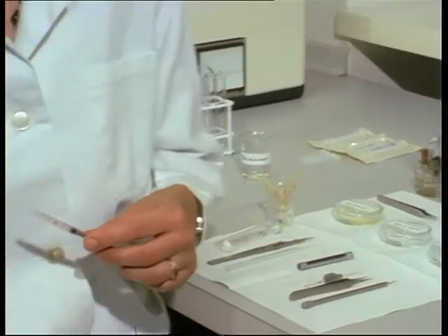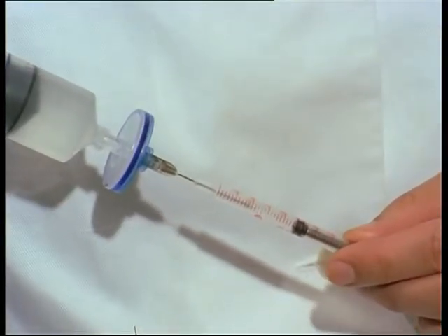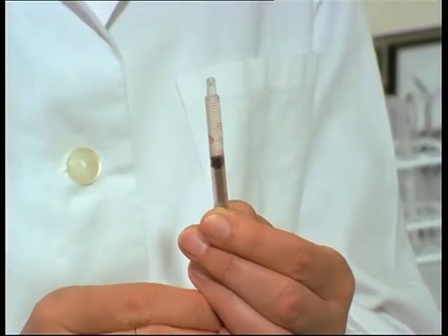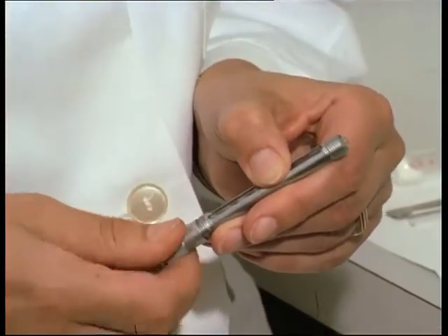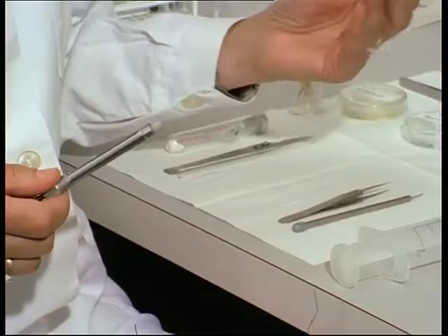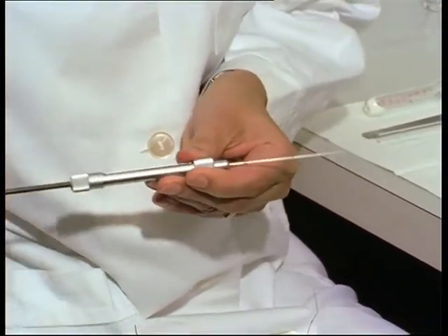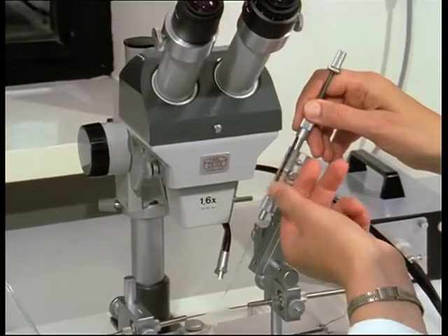Now the insemination syringe is filled with the buffer solution. Bubbles of air are carefully removed. The syringe is assembled and the column of liquid advanced to the front, save for a small bubble of air at the tip of the glass tube. Then the syringe is mounted on the insemination apparatus.